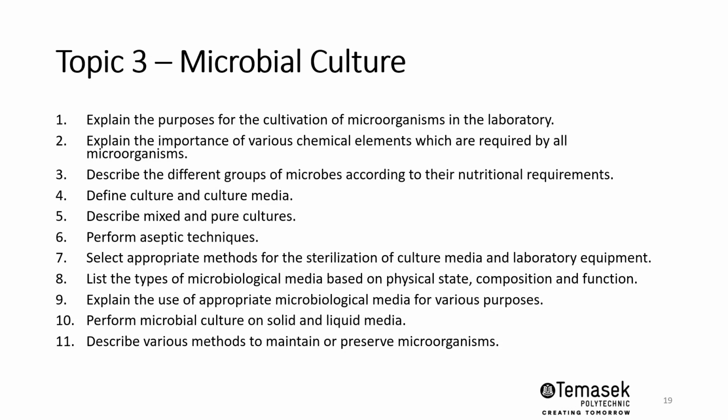Here I'm showing the learning outcomes for topic 3. So in part 2 of this e-recording, we're going to look at defining culture and culture media, describing mixed and pure culture. We'll look at some of the aseptic techniques, as well as describing some of the methods that we can use for sterilization of the media and the equipment here in the laboratory.